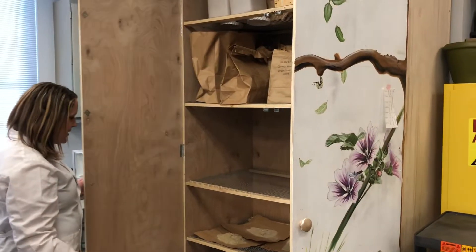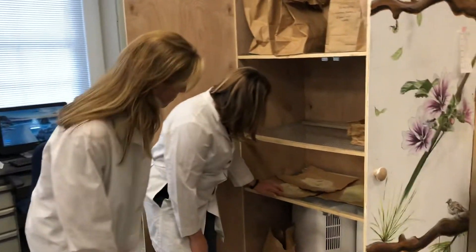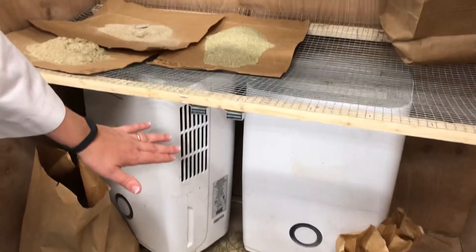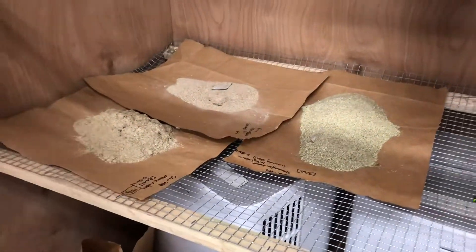So here are our plants — the ones that we collected. It looks like they're down here; they've already been ground to a nice powder. You can see in here we have some basically room dehumidifiers that dry them at a low heat and with some air circulation.